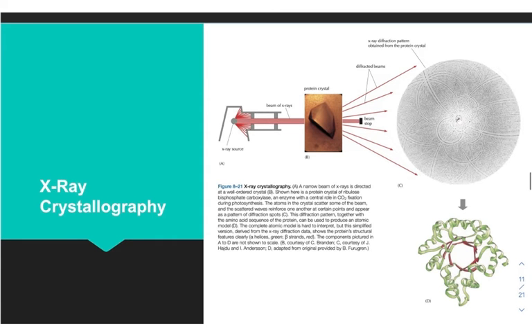And then another technique that involves light, but we're getting here more into physics than chemistry, is called X-ray crystallography. And if you ever heard the story about how the structure of DNA was discovered, there was this lab and this scientist called Rosalind Franklin, and she did X-ray crystallography on DNA. And the way that this worked was she would shine an X-ray toward the DNA crystal.